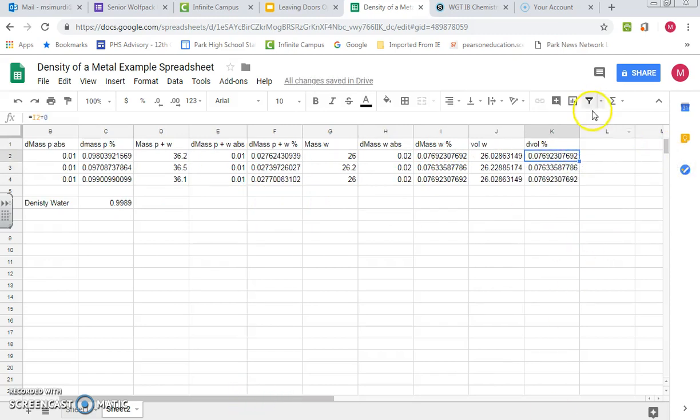And if I want to get that back to absolutes, what I will do is it equals the percentage. We divide the percentage by 100, and I will times it by, again, the times is the star above the 8 key, times it by the actual value, and we can fill that down. And so now I've got my part 1 calculations all done.